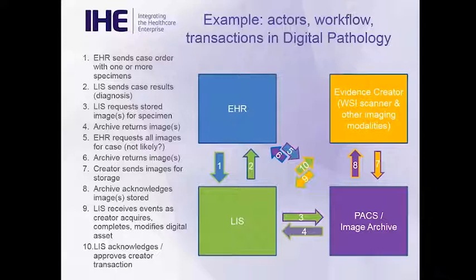IHE does a very nice job of naming actors. So instead of describing an LIS as having a prescriptive set of functions or functionality, there's a description of an order filler that takes an order that's placed by a physician, say in the EHR, that's described as the order placer, and then that order is translated into various work order steps and acquisition of digital assets, which are then managed by asset managers and evidence creators to do things with that digital image.